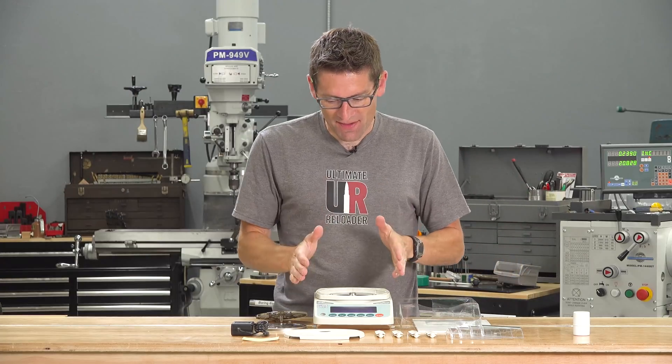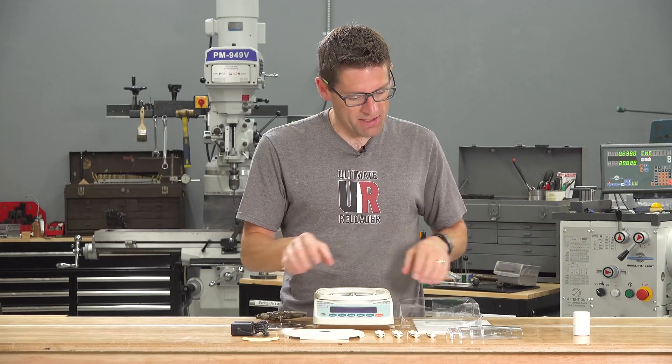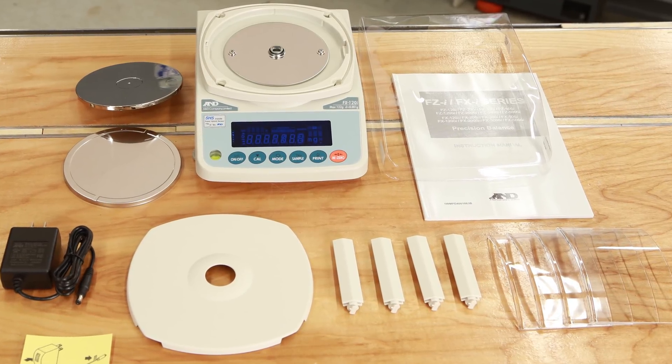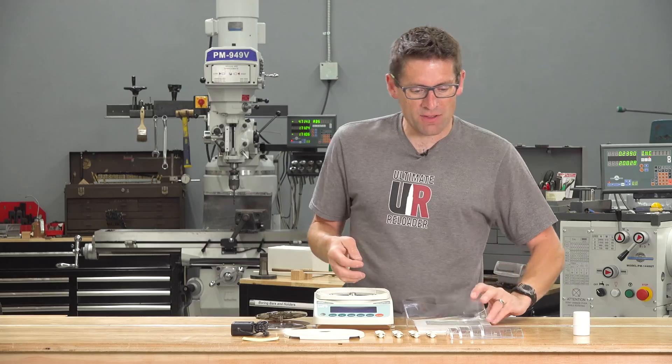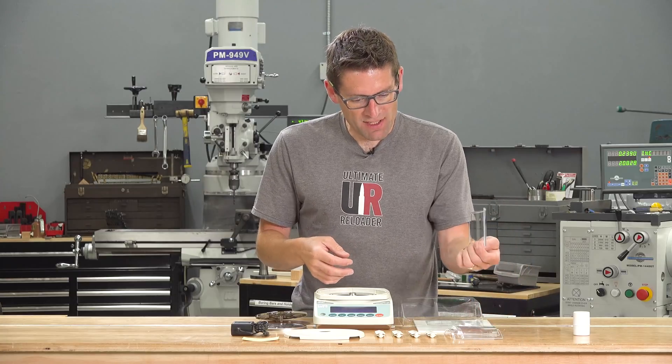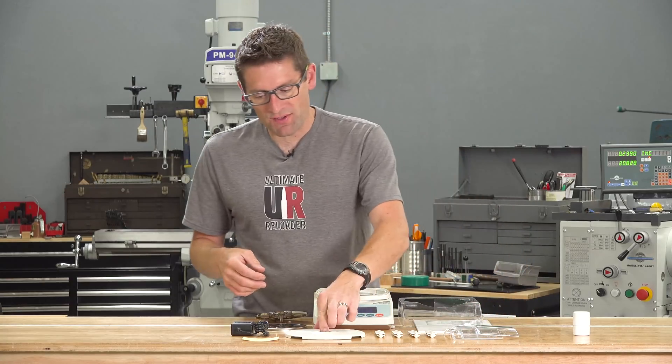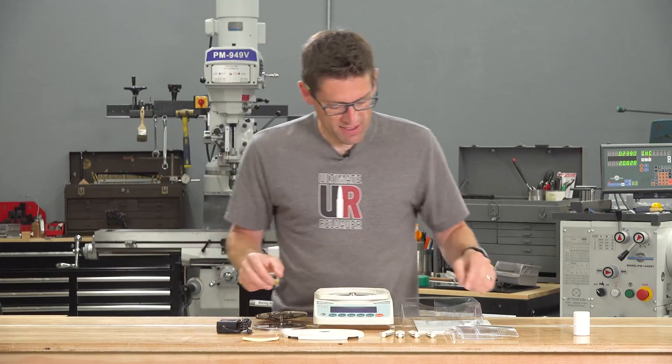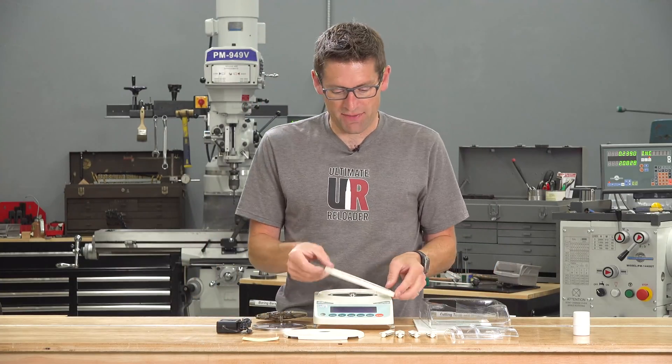So here's what we have. I unpacked everything, I won't make you watch that. We've got the scale itself, the pan base and the pan. We've got a dust cover that goes over the main unit body there. We've got the instruction manual. These are wind screens, vertical supports, the lid, and the AC adapter. So I'm going to go ahead and put this scale together real quick.